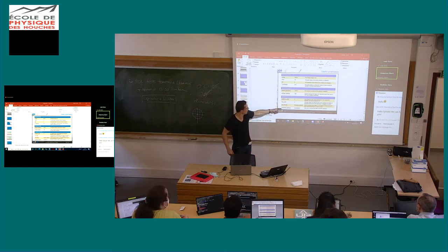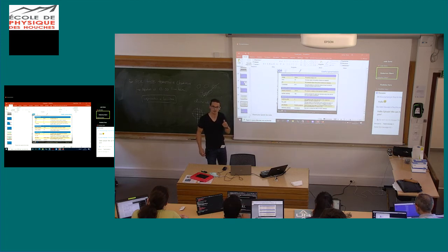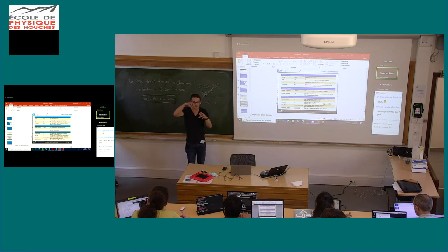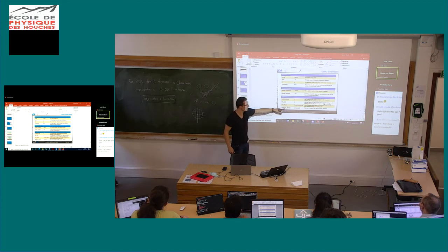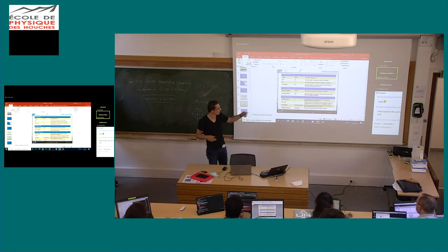Okay, and then the final keyword is the vibrational damping. This will model how the temperature will affect your results. When you vibrate your atoms, they appear bigger than they are for the photoelectron, and this vibration, of course, will damp the signal. So the modulation that you will observe will be lower, or some interferences may also disappear. And this is modeled with this keyword. There are two ways of modeling it. Either you use the Debye-Waller approach, or you can use the averaging of the TL, which is a more correct approach. So an averaging over the TL is done.